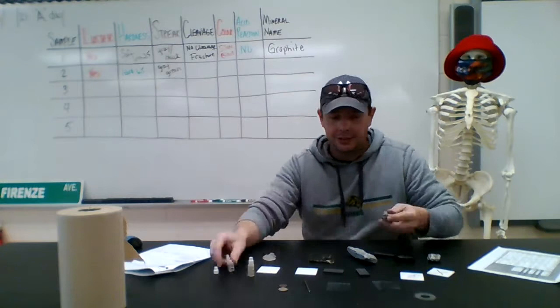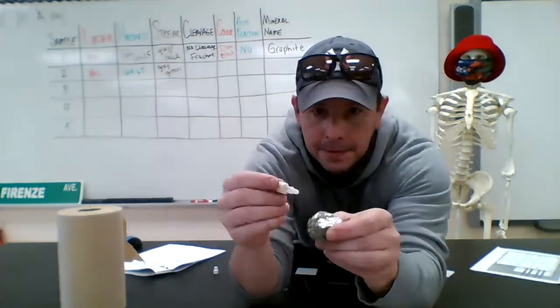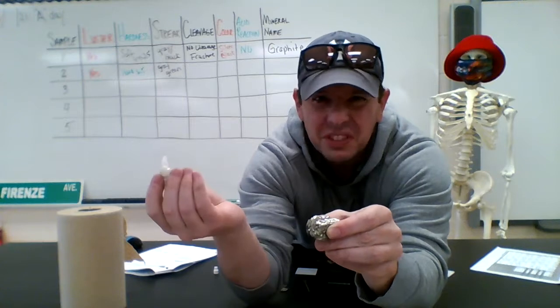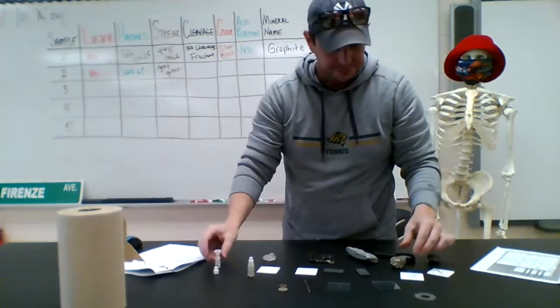And now the fun test, reaction to acid. Here we go. Let me get close again. Let's see. Nothing. I was hoping for something. Nothing. All right. Cool. So no reaction to acid.